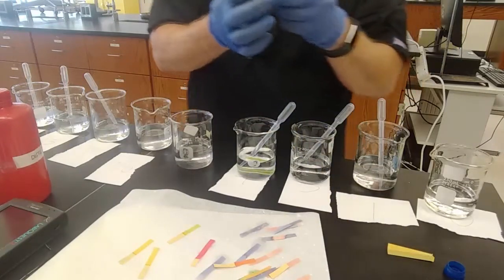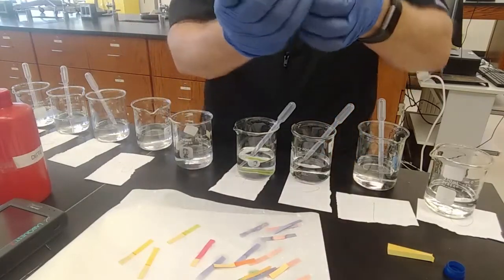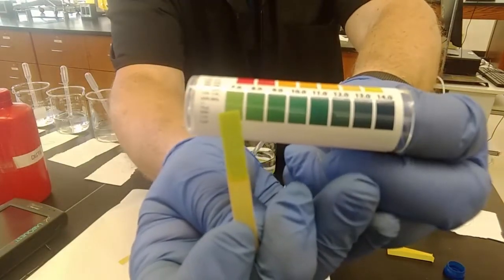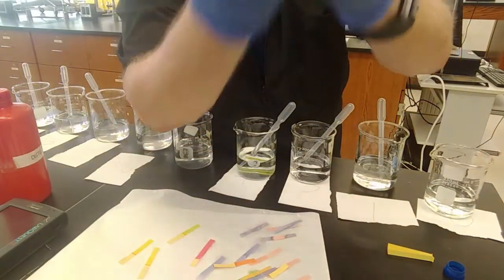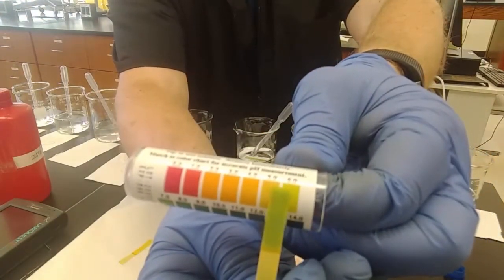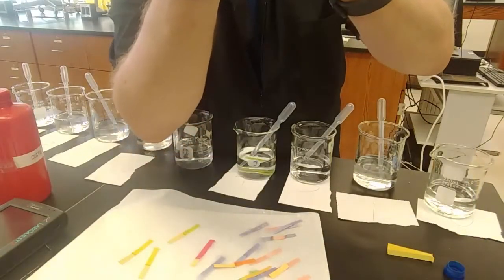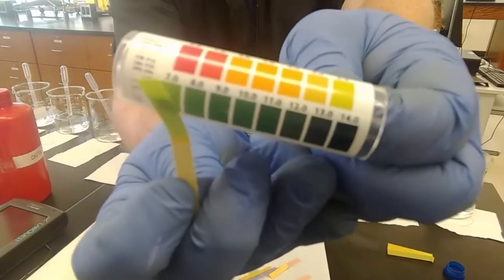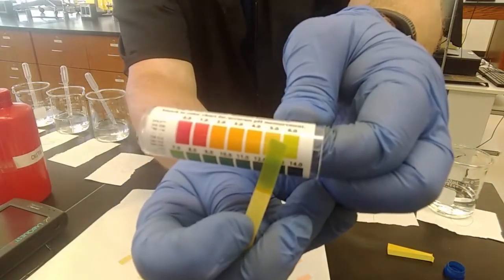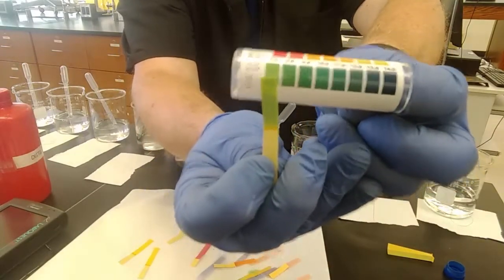On to 11. Still acidic according to the meter. Still like a 6, right? We're not all the way to 7, I don't think. No, right? It's still lighter green than 7. From around a 6, between a 6 and a 7. How about that? It's between a 6 and a 7. 6.5, let's say. So we're expecting 11, and we're seeing a 6.5 based on this pH strip color. It's not quite pea green, but not quite forest green. Somewhere in the middle there.